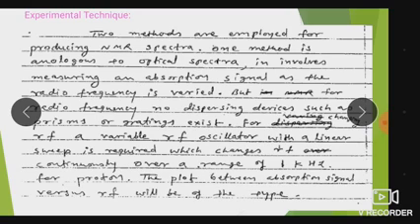The plot between absorption signal and varying RF will be of this type. There are two types of techniques used. In this optical-type method, we deal only with the change in RF frequency, using a variable frequency oscillator without any optical instrument, such as a slit, grating or prism.